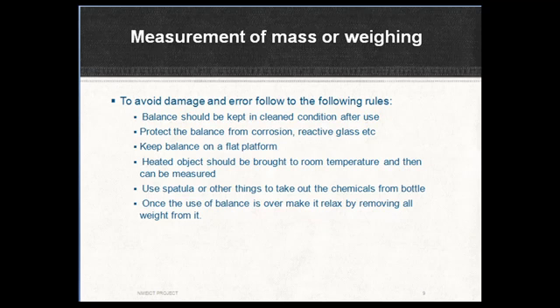flat platform. Heated objects should be brought to room temperature and then can be measured. Use a spatula or other tools to take out the chemicals from the bottle. Once the use of the balance is over, make it relaxed by removing all weight from it.